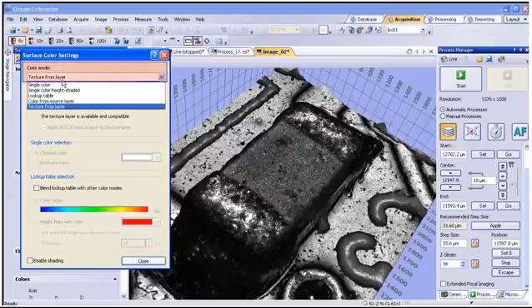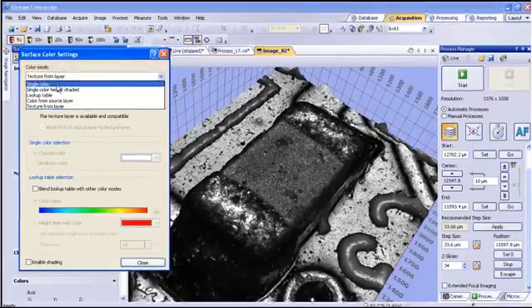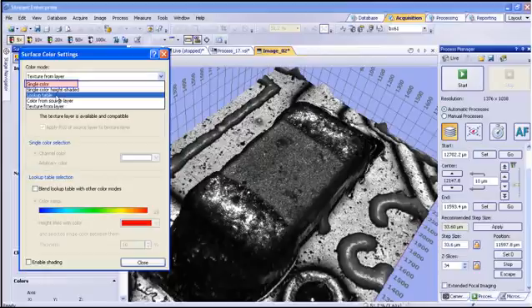You can also select the color mode from the drop-down. Single color provides the height data in a single color overlay. Single color height shaded provides the height data with gray value shading of low to high. Lookup table provides a color band overlay of the height data. And color from source layer is another gray value height data.